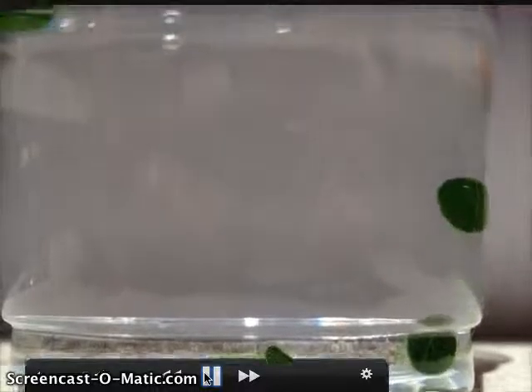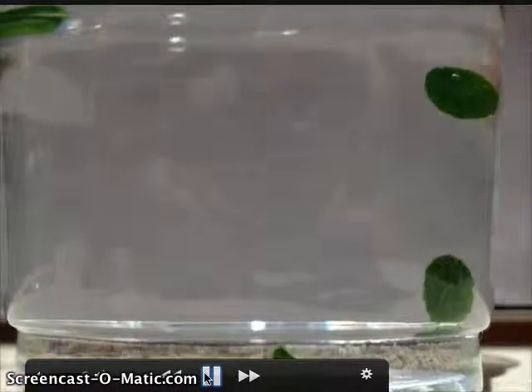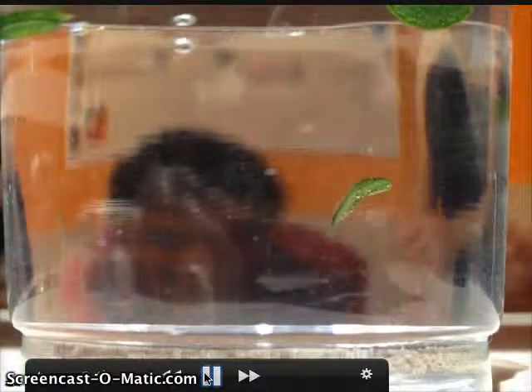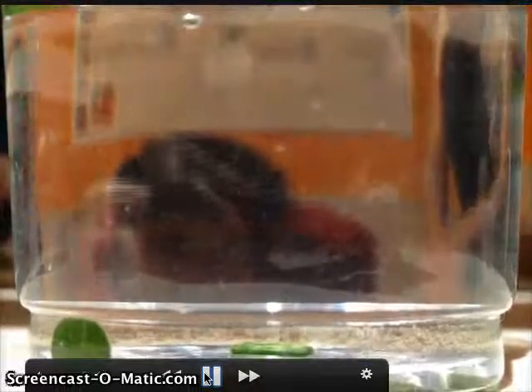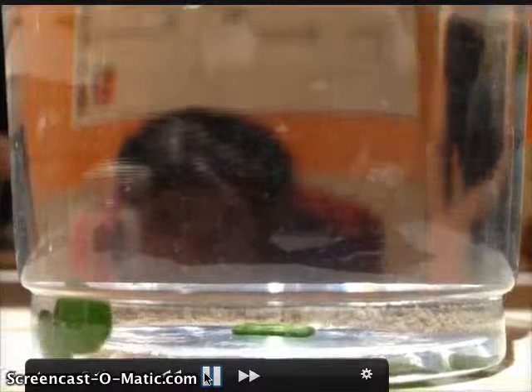And fortunately, 4 out of 5 groups were able to get rate of photosynthesis data based on the flotation of these discs the first time around. I was very happy that I decided to undertake this particular AP biology lab. Lots of great learning and lots of hands-on inquiry during this particular lab activity.